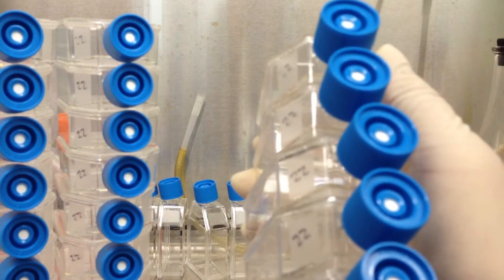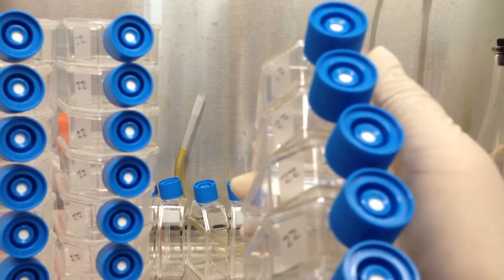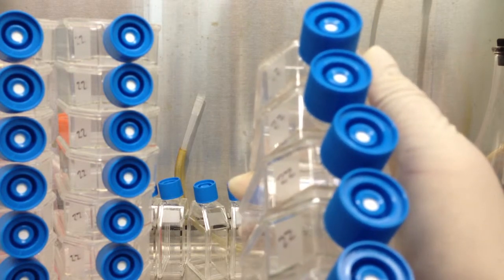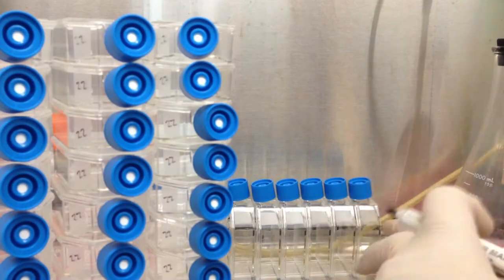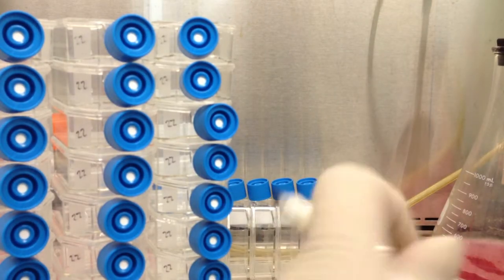I don't date things necessarily, simply because I can write on a post-it and stick it on the incubator of the number of the passage and the date that I split. And I don't need those for right now. Or, I guess I do.